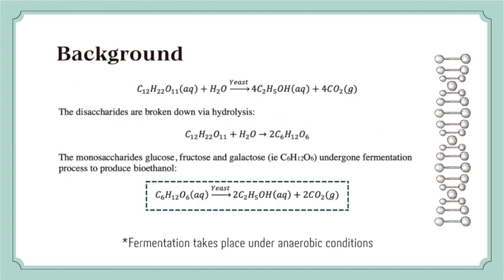The efficiency and rate of this fermentation depend heavily on factors like temperature, yeast concentration, and sugar concentration. By studying these factors, we can better understand how to optimize ethanol production for industrial applications.